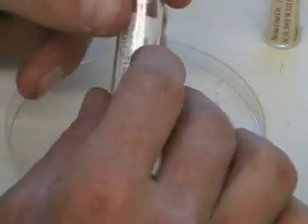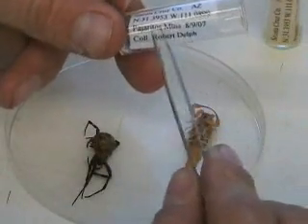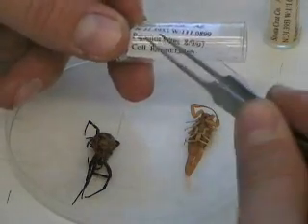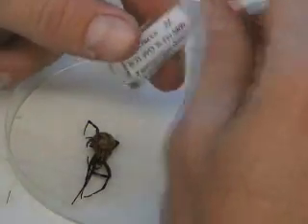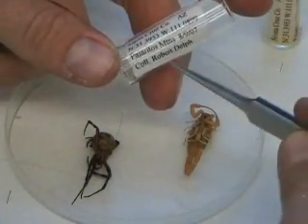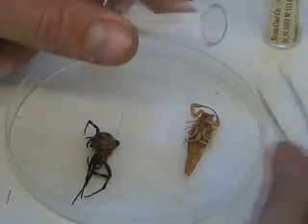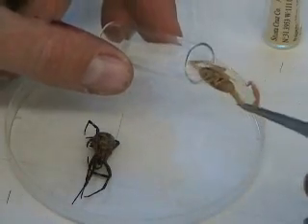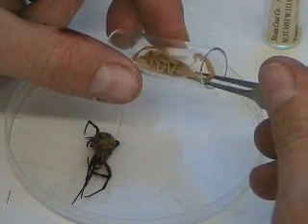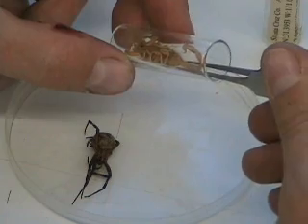You put a label in the vial, and we use inkjet printing on a special type of paper so that the ink does not come off the label. The label is always facing outside so you can see the information on the label, and you can also see the specimen inside. I take the specimen, put it in the vial, and try to place it in an orientation that is easy to identify.